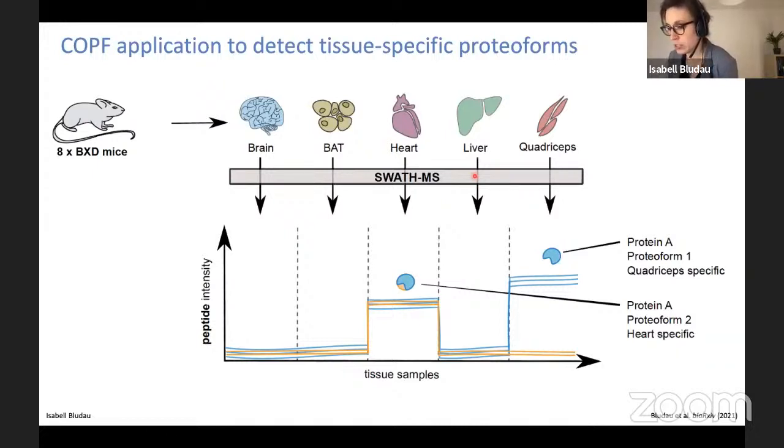And another question, in complex protein discovery, can you summarize the weak points of SEC-SWATH-MS and the bioinformatic workflow exposed here? So the weak points, I would say, are that you definitely need prior information, as I said. So this means that if you use a non-model organism, for example, you're depending on information that might be from homologous mapping or things like this, and you have just very little information.